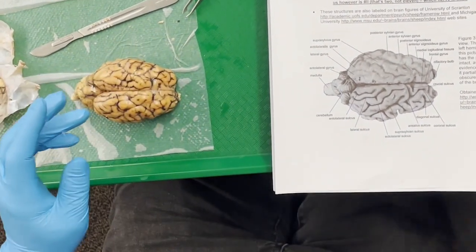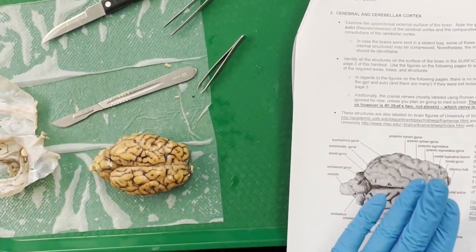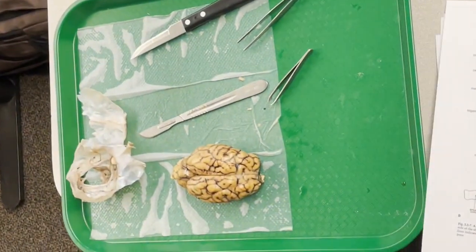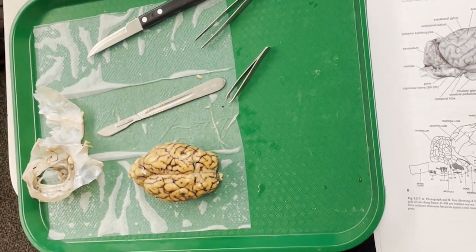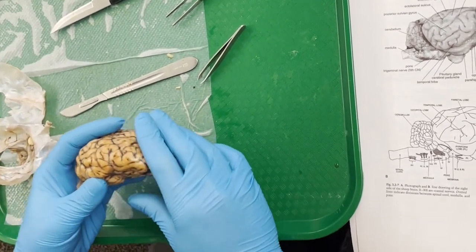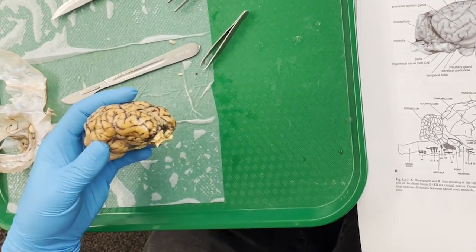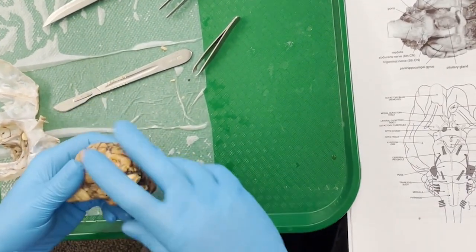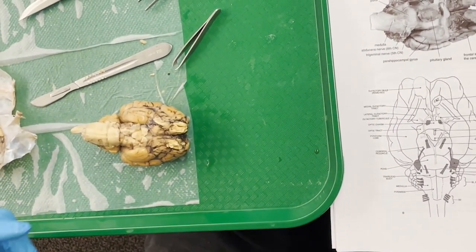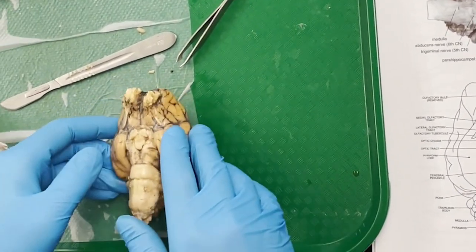So that's all well and good, but what we end up caring about is the other stuff that we can see in subsequent pages. So if we view it from the side, we can start to see some other stuff, such as where approximately the lobes might be. And in particular, we'll see a lot more as we reorient the diagram to page 7 and look at it from the underside. So I recommend flipping the brain over on its, quote, back, end quote. And as you're looking at this from the underside, what you'll end up seeing are various things.